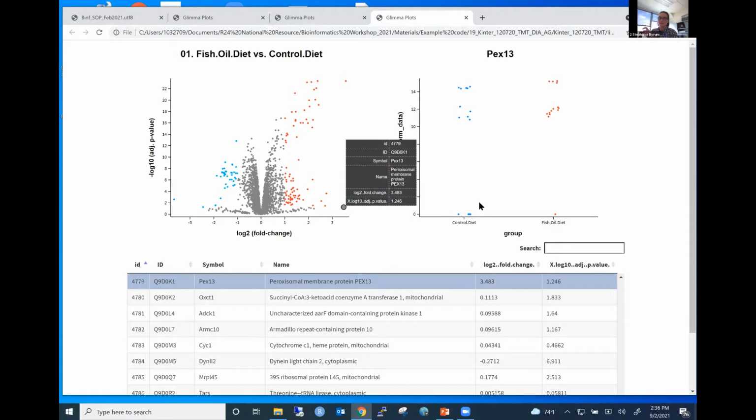There's one thing you have to watch out for with limma when you're doing an lmFit model design. If you have your missing values set as NA instead of 0, then any protein that has an NA is omitted from the statistical analysis. If it's a 0, it's included and will impact your fold change. So how you set those missing values before you do the statistics will impact your fold change information. I have found that little caveat.